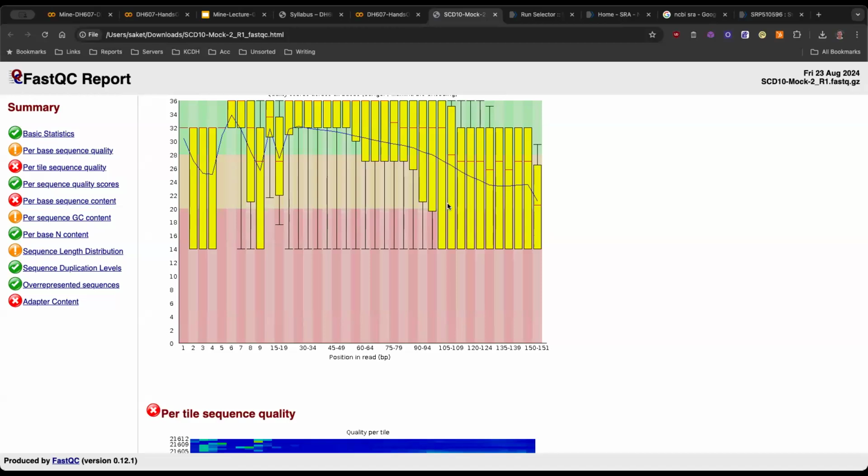How does sequencing happen? That is clear, right? You start from a flow cell. There is a sequence that is tethered to it. This is the read fragment you want to sequence. The polymerase will start. It will incorporate one base at a time. That base has a problem, not a problem, it's a feature, not a bug. The feature is that it emits a fluorophore. But because of that feature, it cannot extend anymore. So something has to come and wash this fluorophore off before it starts again. And all this time the polymerase is working.